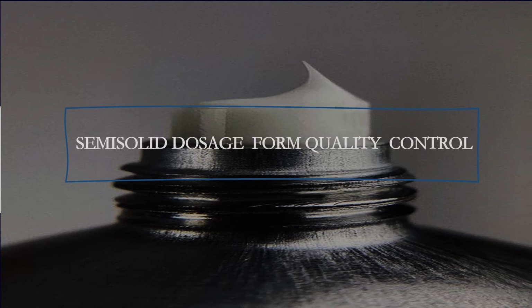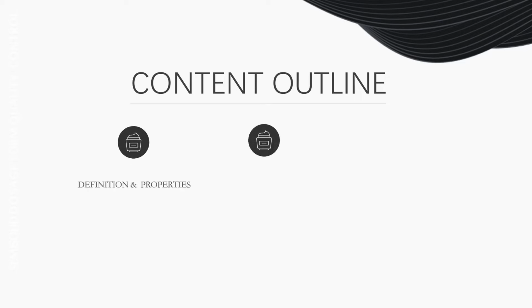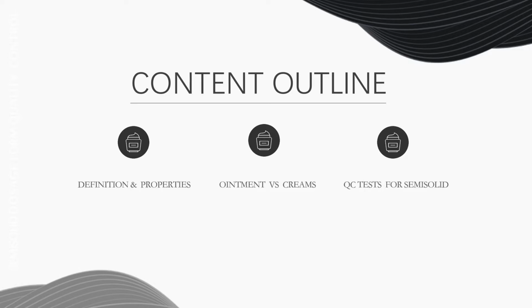Semi-solid dosage form quality control. Content outline: definition and properties, ointment versus creams, quality control test for semi-solid.